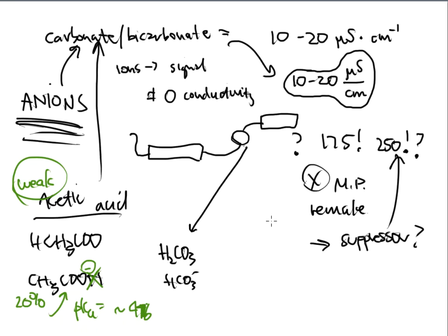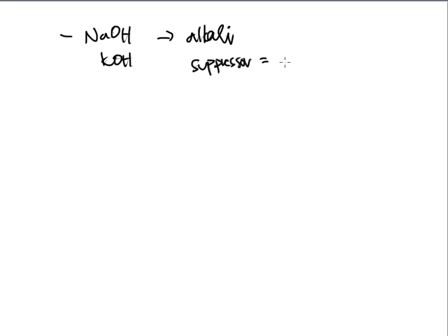All right? Okay, now the next mobile phase that's up to bat, this is another common anion mobile phase, and this mobile phase is going to be just hydroxide based. Typically, NaOH or KOH is used for this alkali mobile phase that goes onto the IC system. All right? The good thing about sodium hydroxide and potassium hydroxide, when it goes through the suppressor unit, remember how we said that the bicarbonate makes carbonic acid sometimes? The suppressor unit, when these go through, it's actually going to produce water.